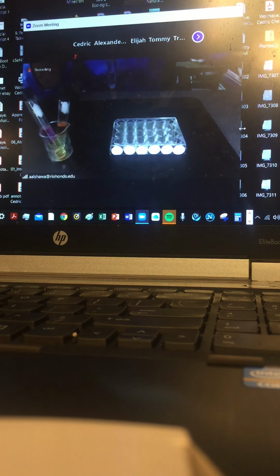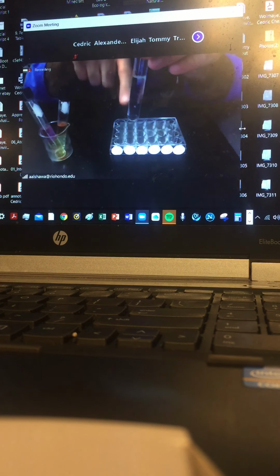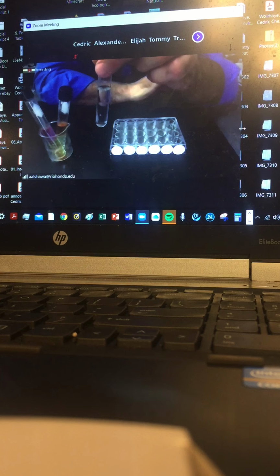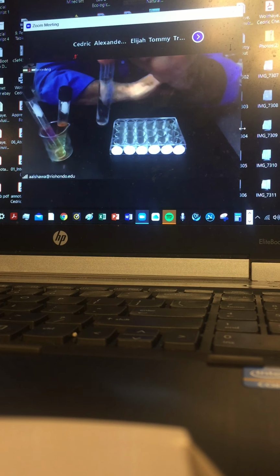So the layer to check all the time: the bottom layer is the aqueous, the denser, the heavier. The lighter layer is the organic layer, hexane, and in it you're going to find a tremendous number of chlorine molecules infused. They migrate from the aqueous toward the hexane, and a good number of them are found in it.